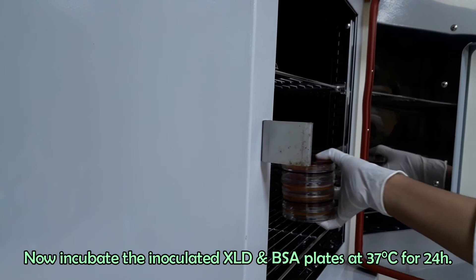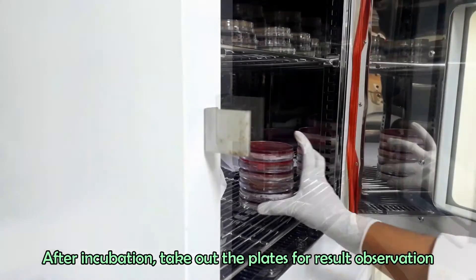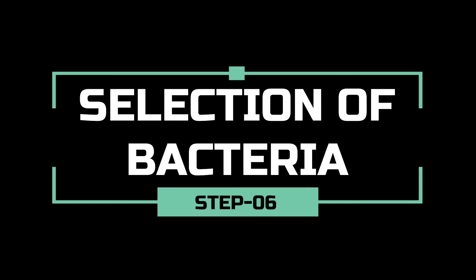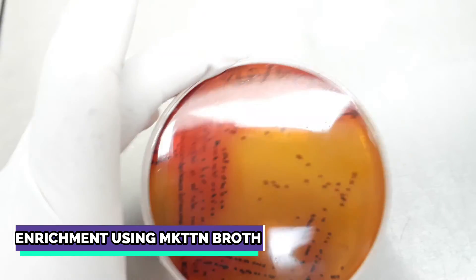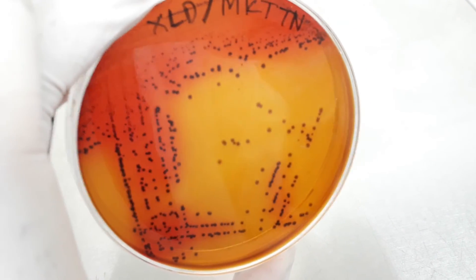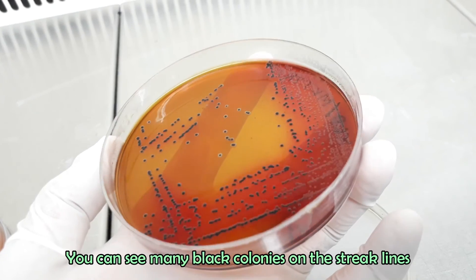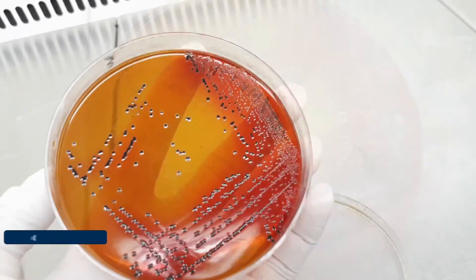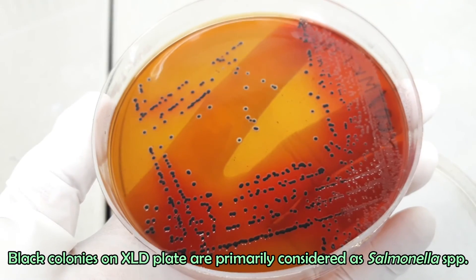Incubate the inoculated culture plates at 37 degrees Celsius for 24 hours. Take out the plates after incubation. Now it's time for result observation and Salmonella colony selection. First, we will observe the XLD plates — these were streaked with MKDTN broth culture. Typical Salmonella species give black colonies on XLD agar. You can see many black colonies on the streak lines along with yellowish colonies. Black colonies are primarily considered as Salmonella species.